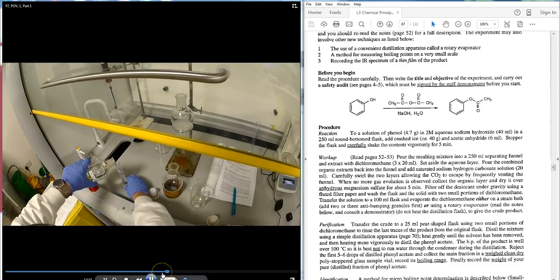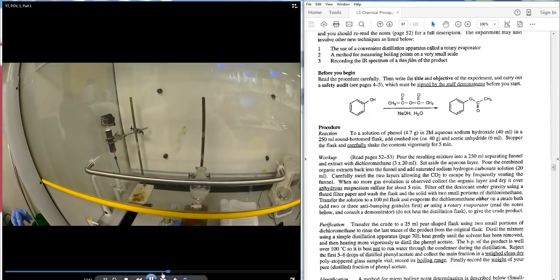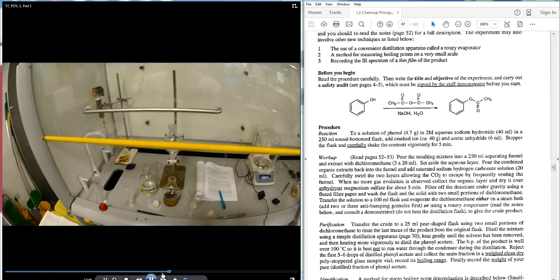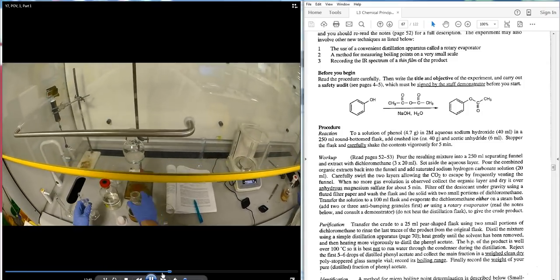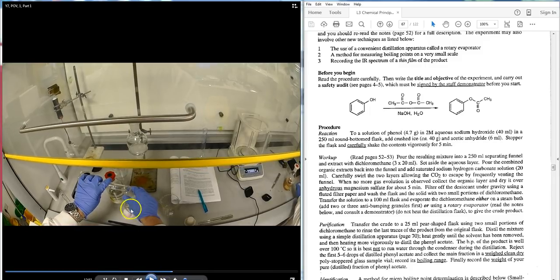Twenty millilitres of DCM is poured out and added into the flask. The student rinses around the contents of the flask with some of that 20 mL DCM — use a Pasteur pipette to rinse out the flask, then transfer to the separatory funnel. The student is clearly aware of transferring all material over with the DCM.